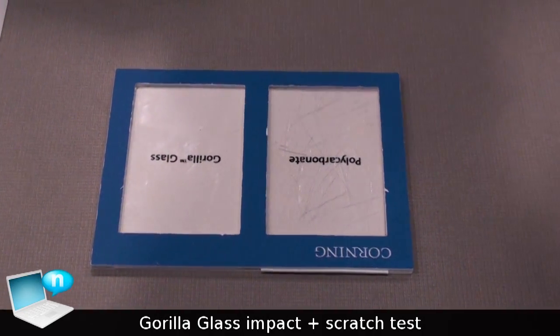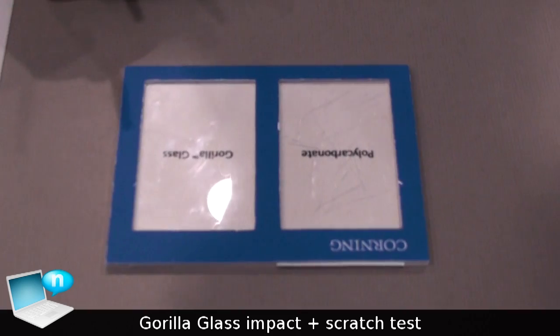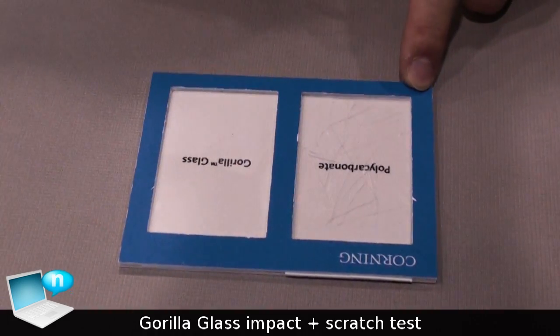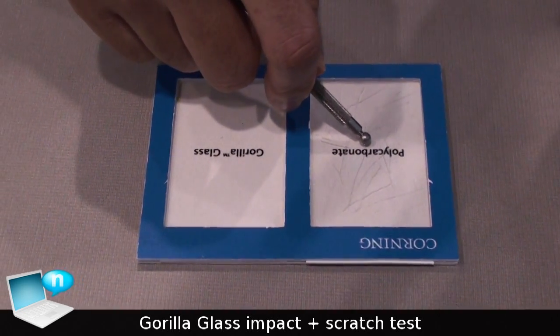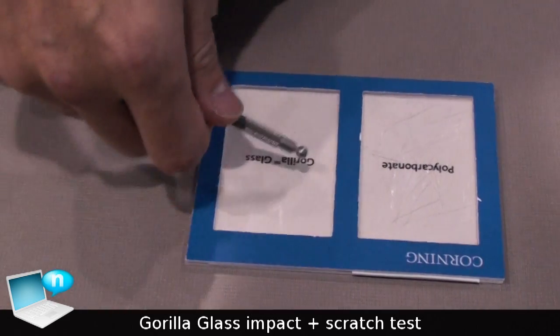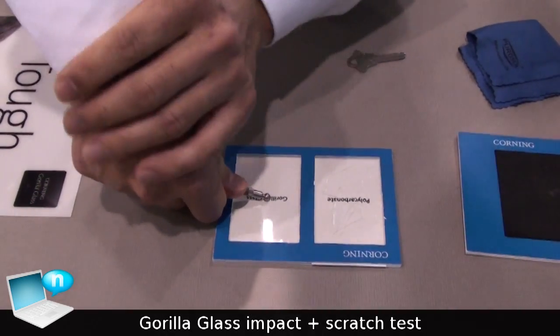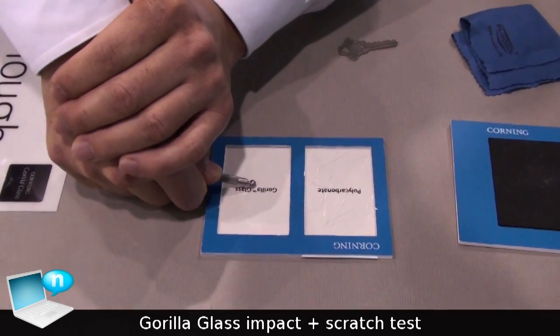What we just did was scratch resistance related stuff, and here I'm going to show you about damage resistance. We're not going to do it in plastic because it has some flexibility. So we're going to do it in Gorilla Glass. What I'm going to do is use the indenter and press down on the Gorilla Glass. I'm actually going to use two hands and also apply some body weight.